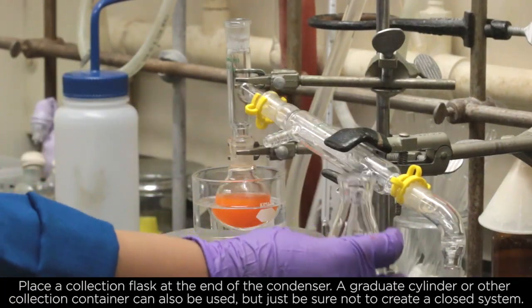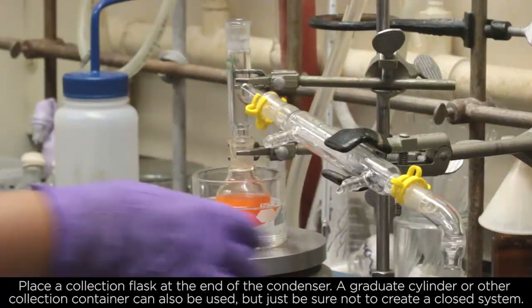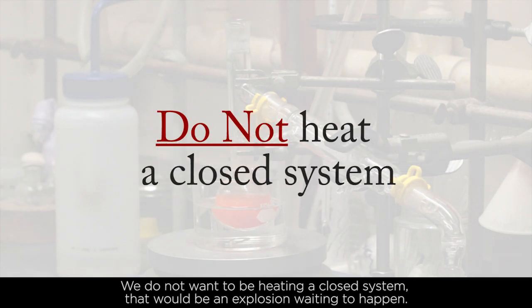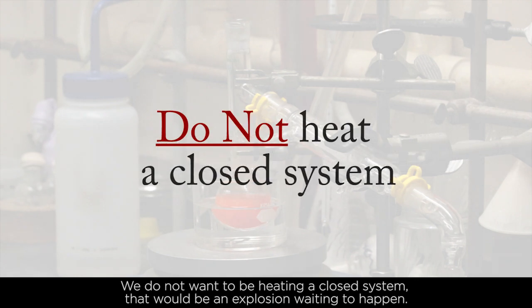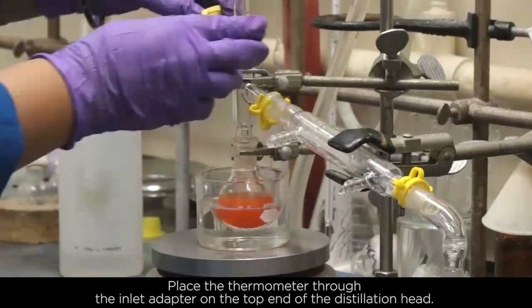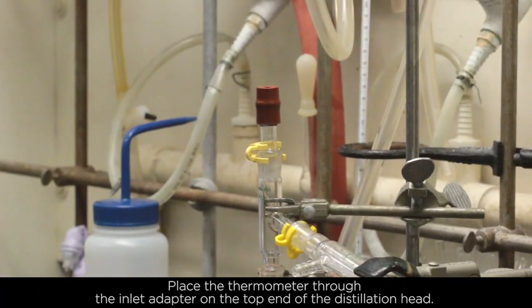A graduated cylinder or other collection container can also be used, but just be sure not to create a closed system. We do not want to be heating a closed system — that would be an explosion waiting to happen. Place the thermometer through the inlet adapter on the top end of the distillation head.